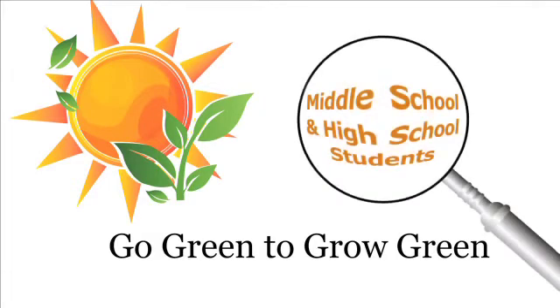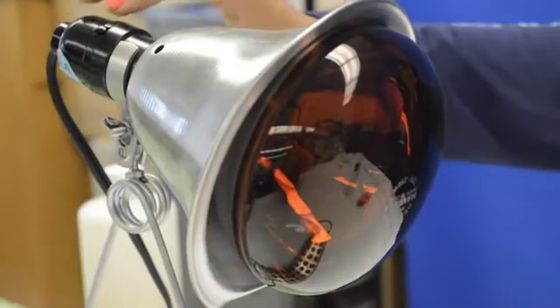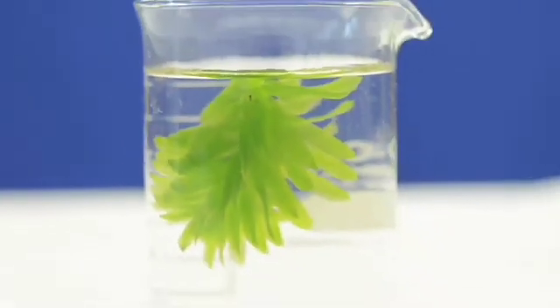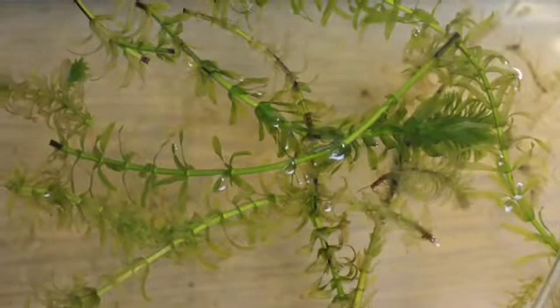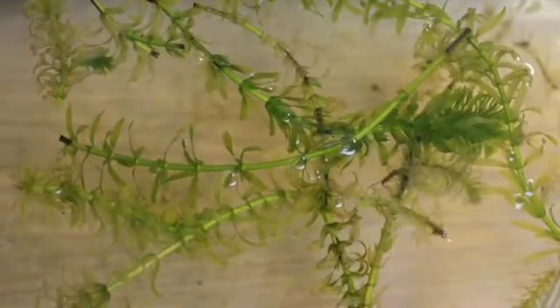This investigation is for middle school and high school students studying energy and dynamics of ecosystems. We will observe how variation in temperature can affect the photosynthetic rate of plants by performing a simple experiment with an aquatic plant called the Anacharis.